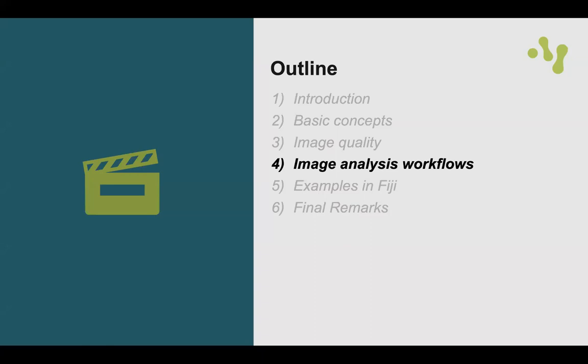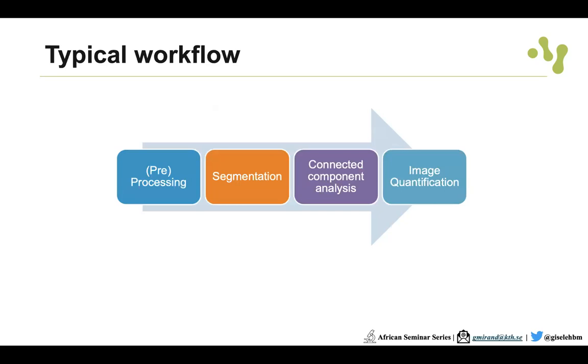Okay, so now we can talk a bit about image analysis workflows. What I would like to talk about is a typical workflow in image analysis.